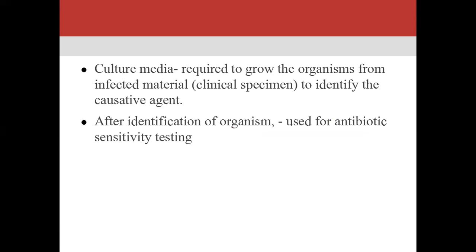First of all, we have to grow the organism. For that, we need a culture media. Culture media consists of all the nutrients which are essential for the growth of the bacteria. And after identification of the organism, the culture media is used for antibiotic sensitivity testing.